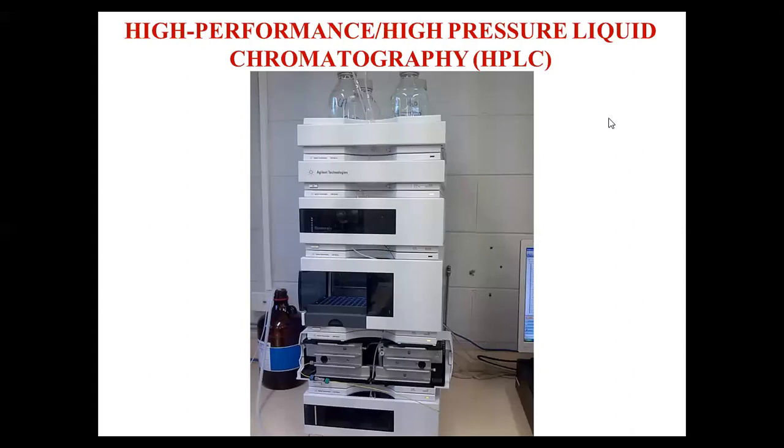So, like the gas chromatographic technique, we have HPLC, which stands for high performance or high pressure liquid chromatography. You can see in the diagram I have presented the instrument, or the chromatograph, of HPLC. Here, the compounds are going to be separated in a medium applied with very high pressure.